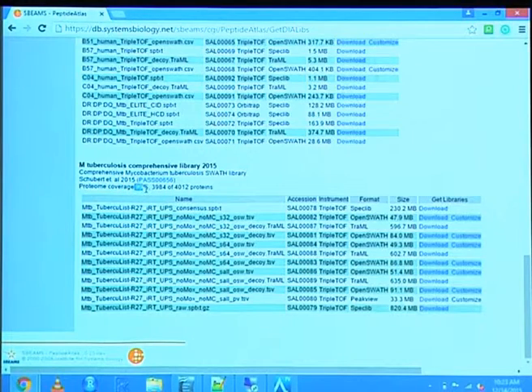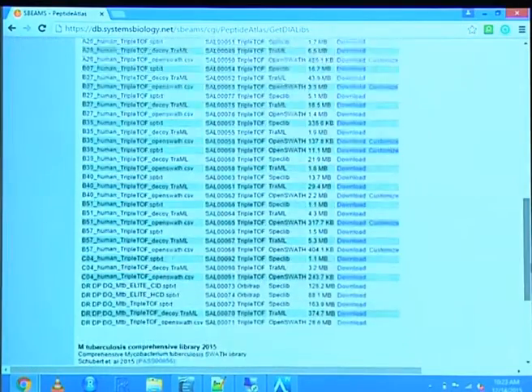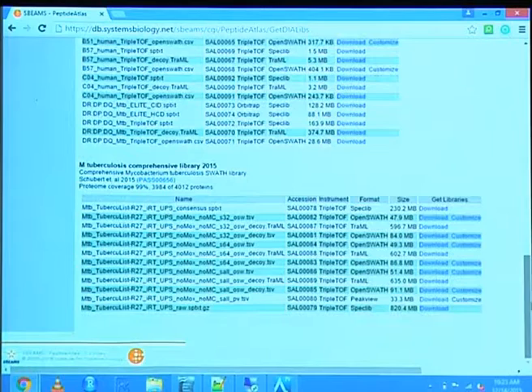Down here some statistics, like coverage, 99% of the proteome, or 3,984 proteins in that case. So it's fairly high coverage. In the case of the human, by the way, this is only the expressed proteome, essentially. So it's only 10,300 proteins, but it should allow you to do most of the projects you would want. Down here, you could just download the PeakView library and do the same thing I did. This is what we're going to look at later on.